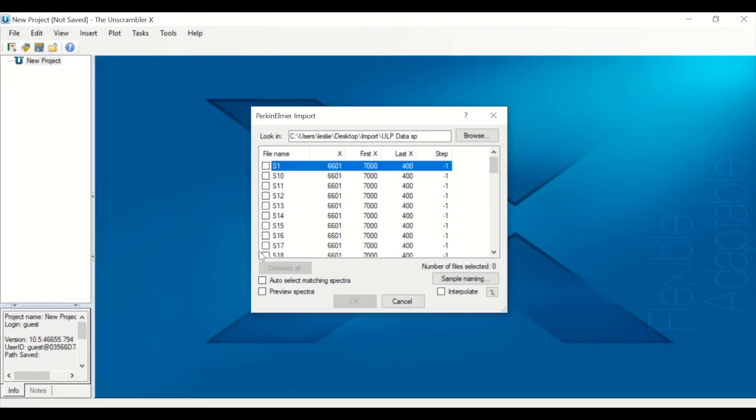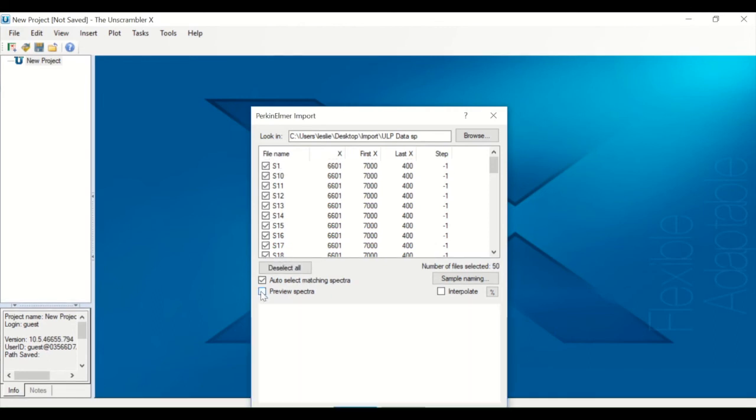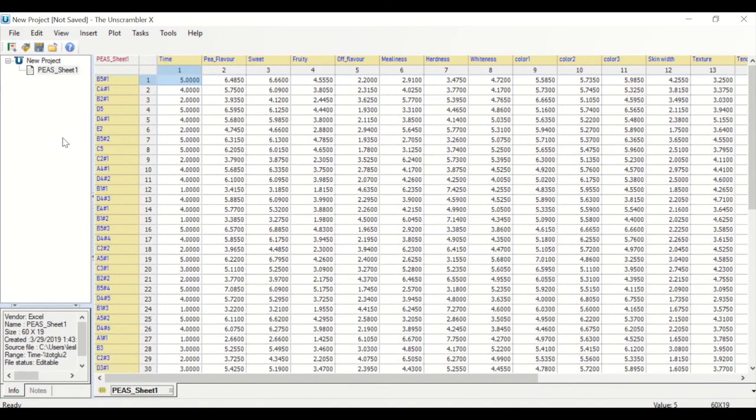Files can also be selected individually. Use the Preview option to take a look at the selected spectra before importing and use the Interpolate option to import spectra with different starting and end points. Complete the import by pressing OK.